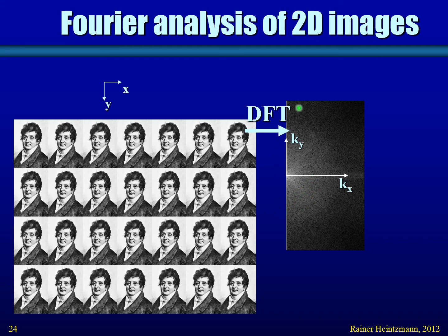However, what it doesn't show you is the second part, a hidden information that in the original Fourier transform, represented as a complex valued thing, would be in there, which is the phase of the wave. And it turns out that the phase is actually more important than the amplitude information. So it shows you precisely this. Let's say if you represent it with a bright, dark, bright sine wave, then it's very important that the dark part is in the middle and not at the side. So the where information is represented in the phase, whereas the how much information is represented in the amplitude.